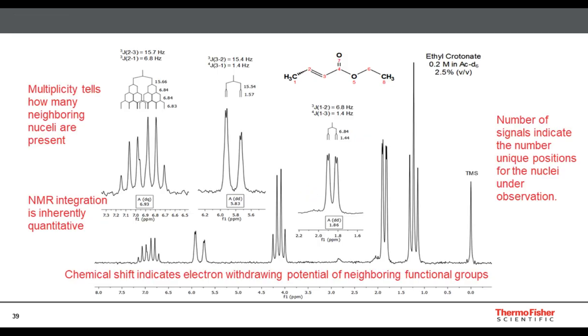Kind of jumping back to what we introduced at the entry level in that organic chemistry class, we spend most of our time talking about how to interpret the spectrum. Just like we spend a lot of time teaching interpretation of the infrared spectrum at the organic chemistry level, we do the same thing. That's where we provide our focus for NMR as well. We talk about how many signals and how those relate to the individual hydrogens, and multiplicity, and that's how an individual signal may split into more than one peak.